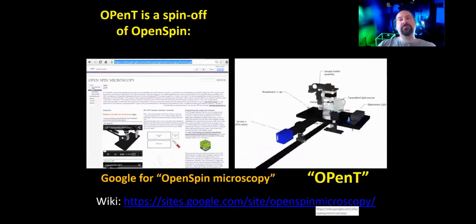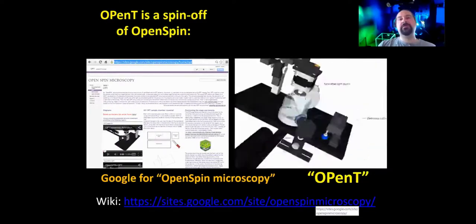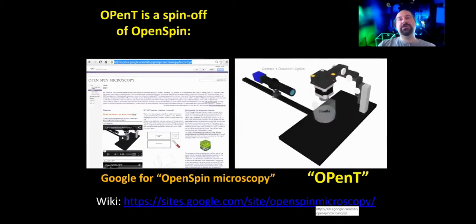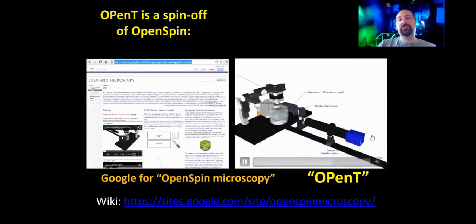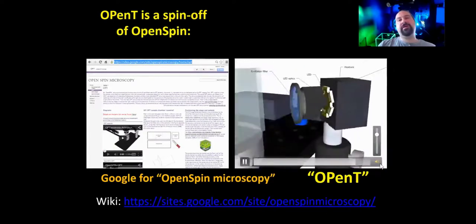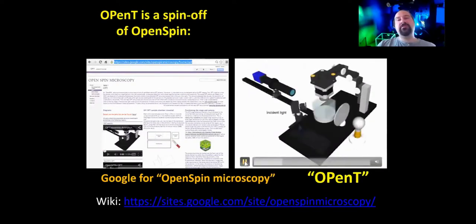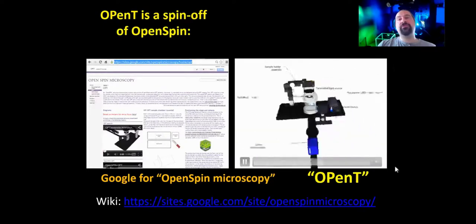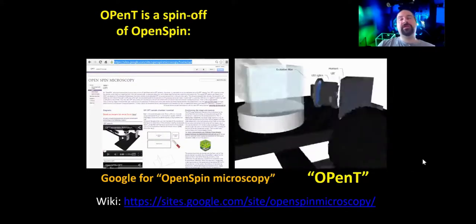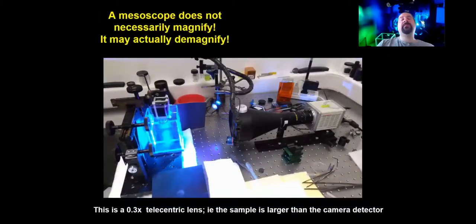With just 2,000 euros or even less, you can build a fairly usable and very interesting setup. You don't need lasers. You don't need very expensive high-end cameras. You can even use a very simple industrial camera, as represented in this diagram here. You can build your own illuminator. And in this case, you use simply an Arduino controller to run the whole setup. It's fairly simple. So is it worth your time?